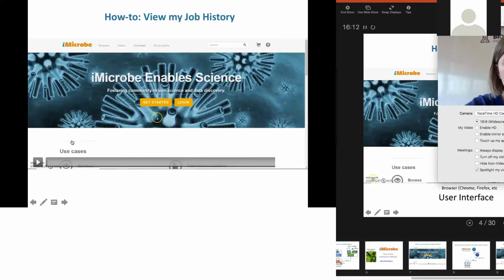And so one of the other things that you might want to do is, after you have run a job, let's say you decided you want to go and get a coffee, and you're going to come back and you want to see how your job is doing. And you want to take a look at the job history. So here we're going to show you how to actually access the job history.